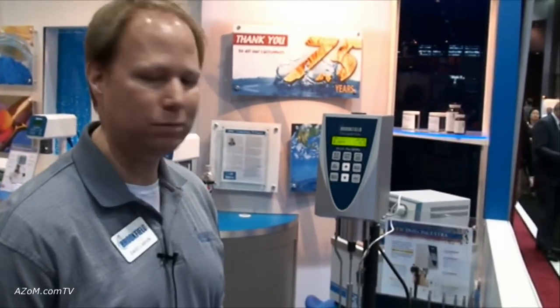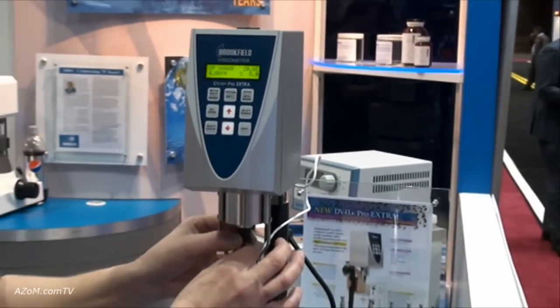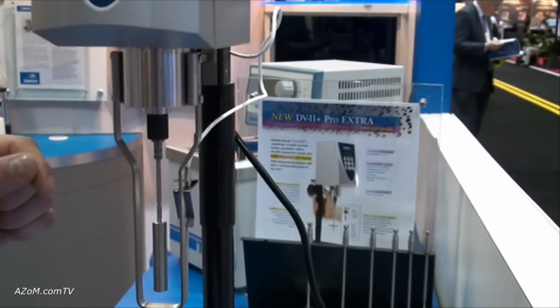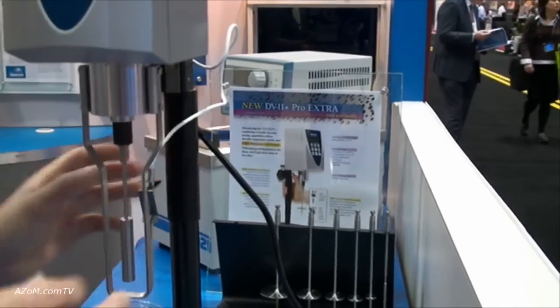Thanks Cameron. This is our Brookfield Engineering Lab. This is our most common model — the DV2 Plus viscometer — and we've done a few things by adding a quick connect spindle, which is new for us, and a quick moving spring loaded lab stand.